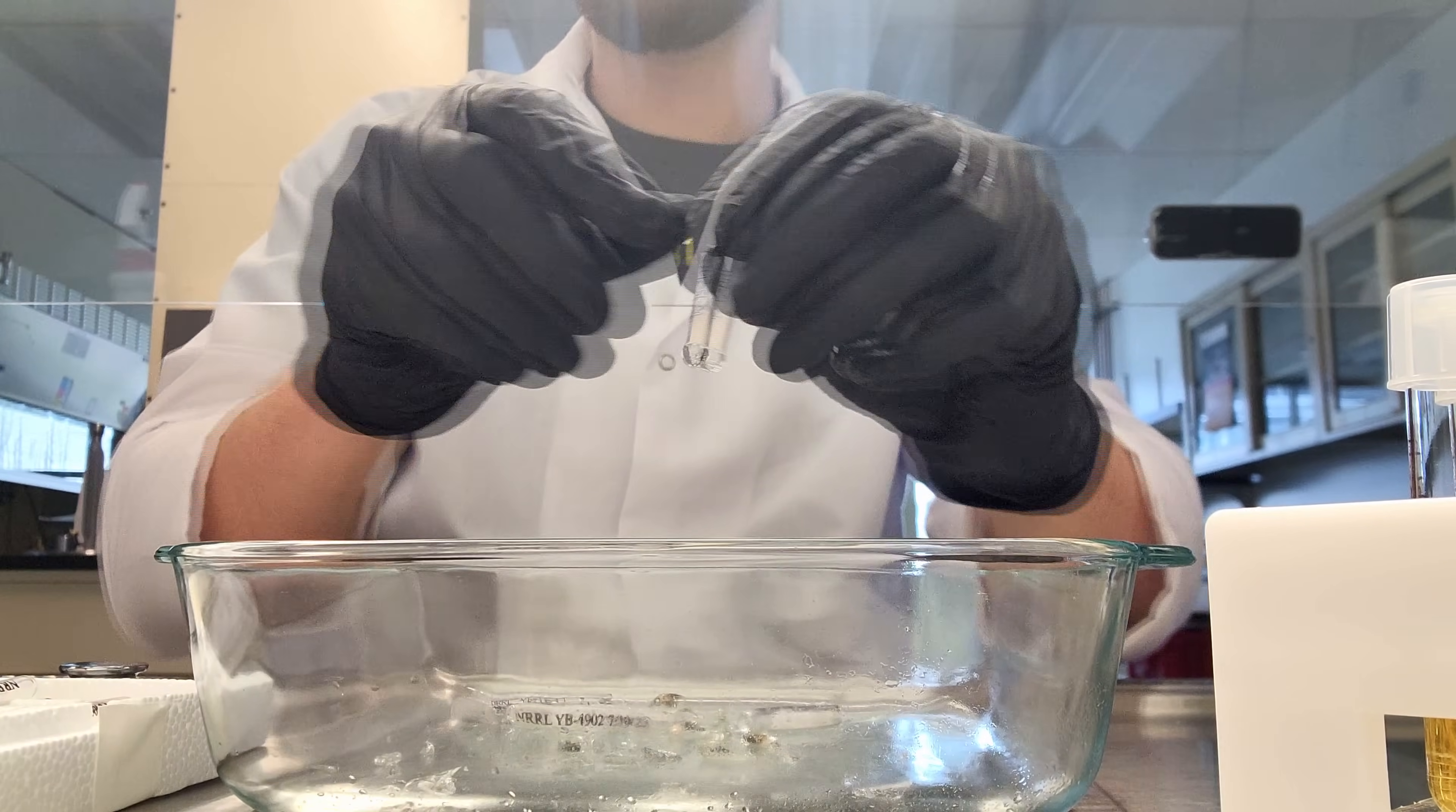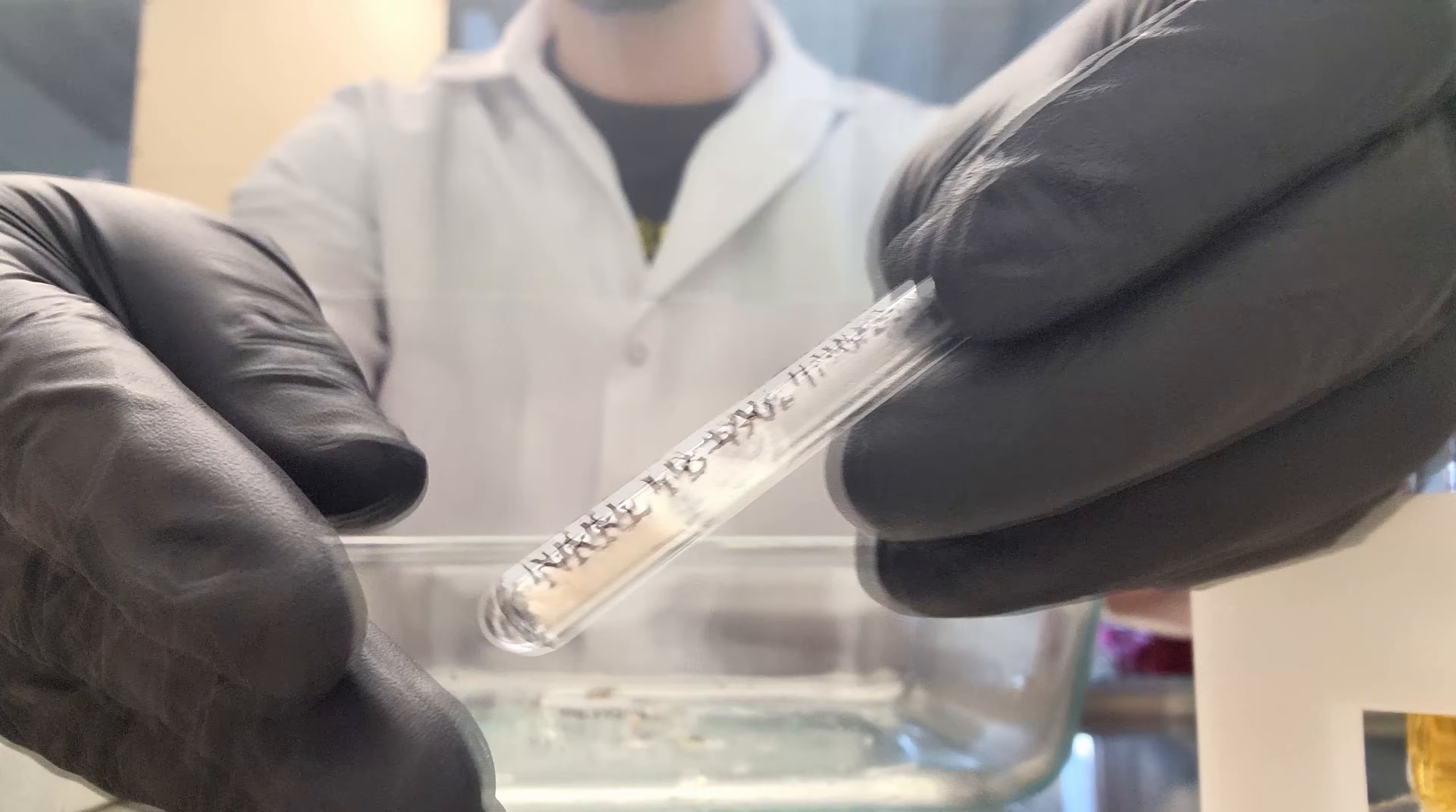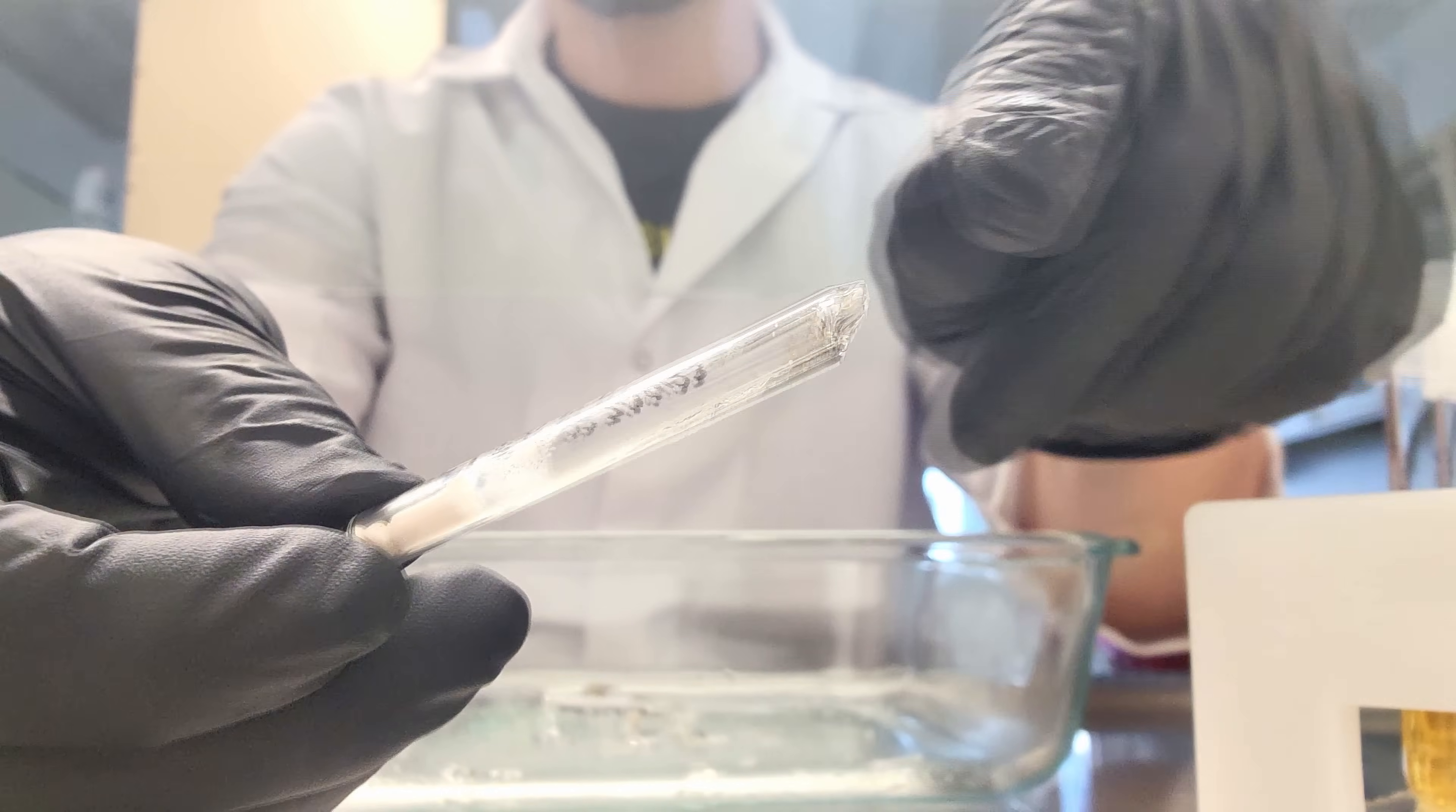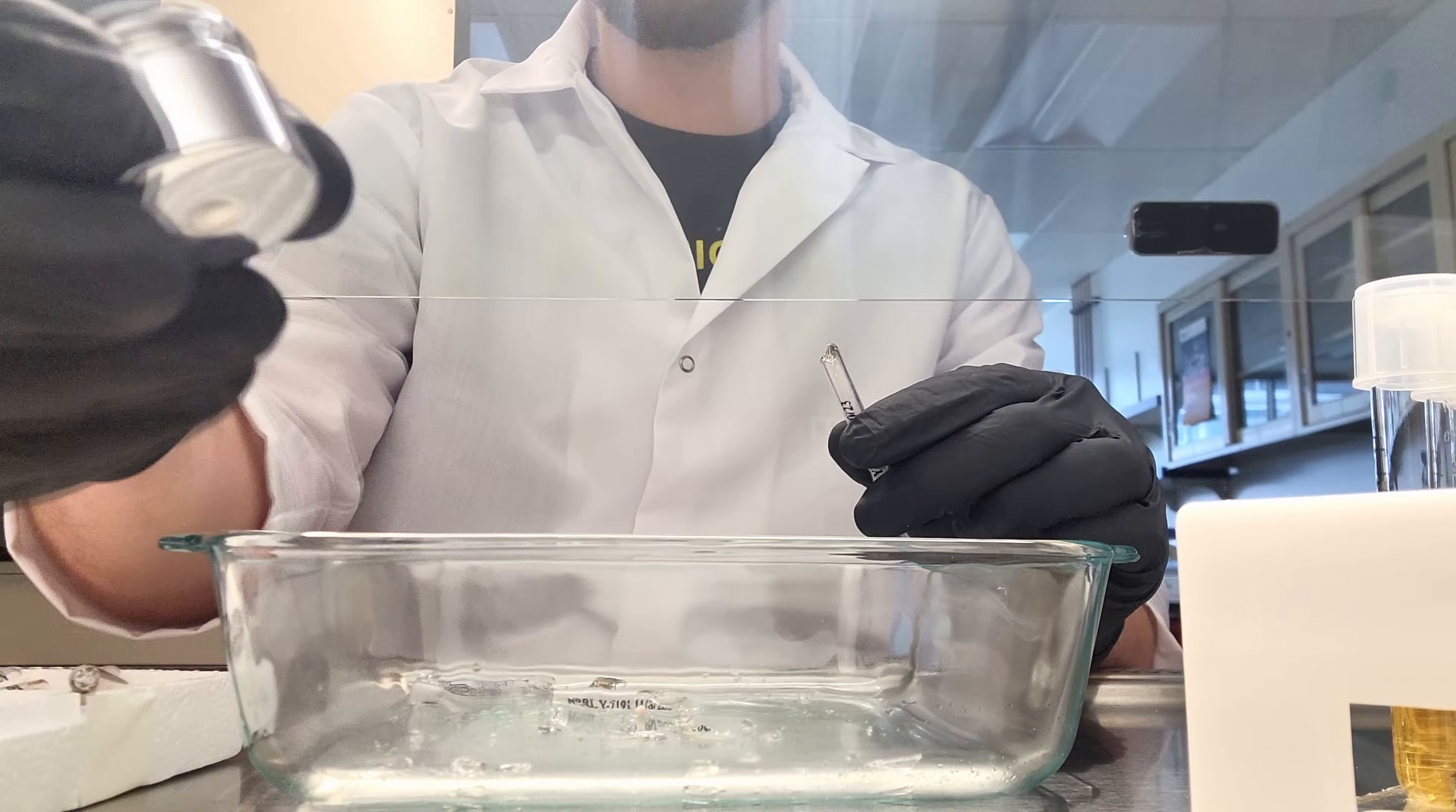There are a few ways to store cells for long periods of time, and I'll show you how to resurrect all of them in today's video. This first one is a lyophilized cell pellet in a glass ampule. These will survive basically indefinitely at room temperature. Lyophilized is the same thing as freeze-dried.